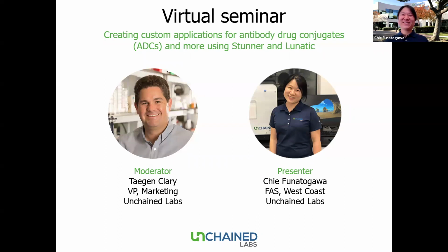Antibody drug conjugates, or ADCs, can be tricky to characterize, and I think people will find it very interesting how the Homebrew tool on Stunner and Lunatic allows for customization of some applications specific to these types of molecules. So I'm looking forward to you presenting on this.